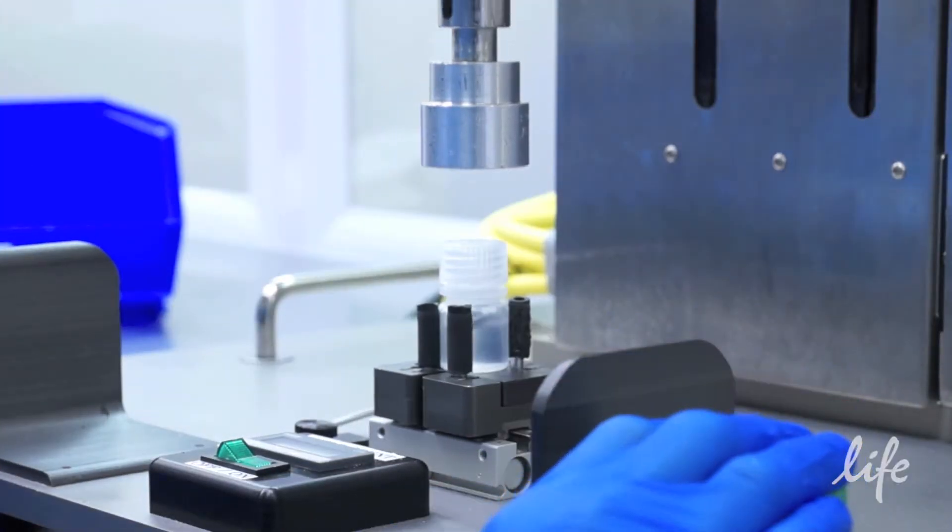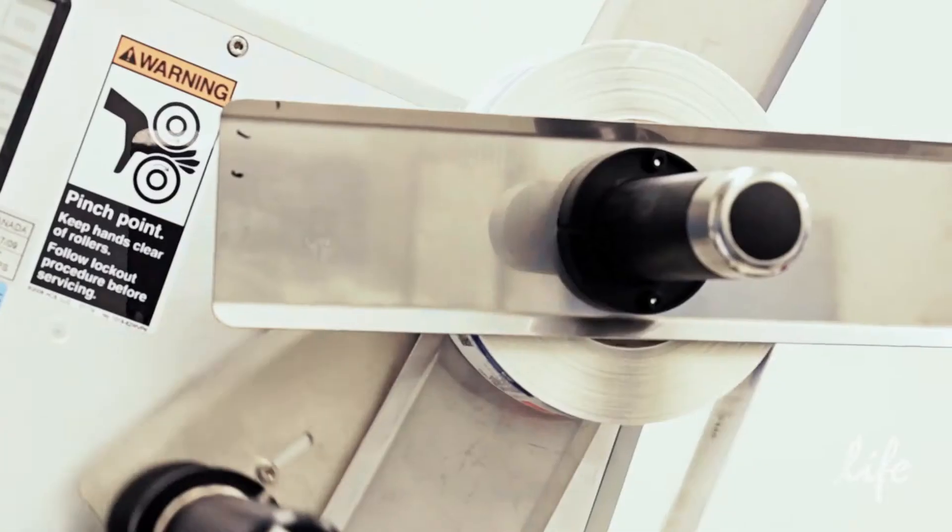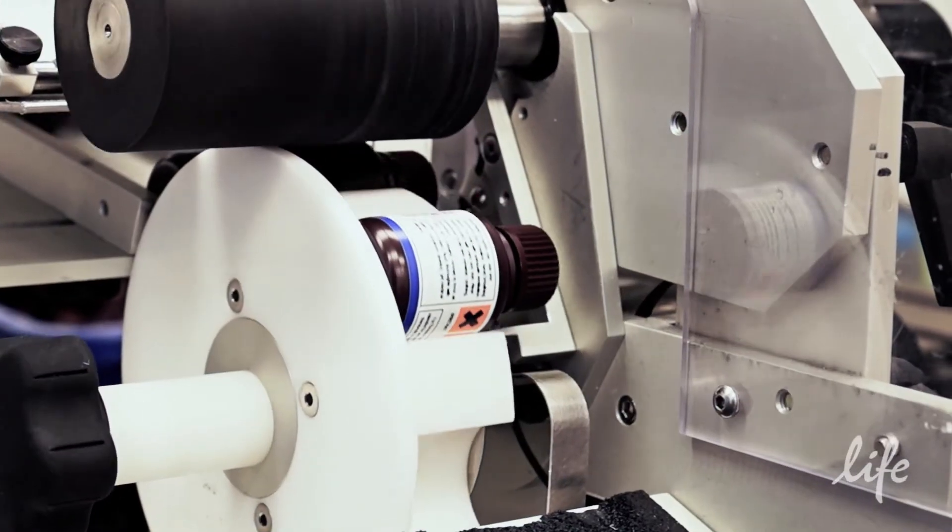This is where the polymer takes the form you use every day: POP4, POP6, and POP7, in any volume you need for your research.